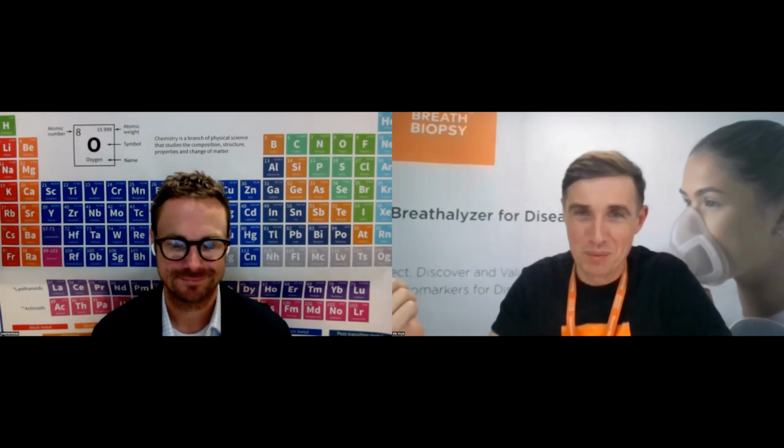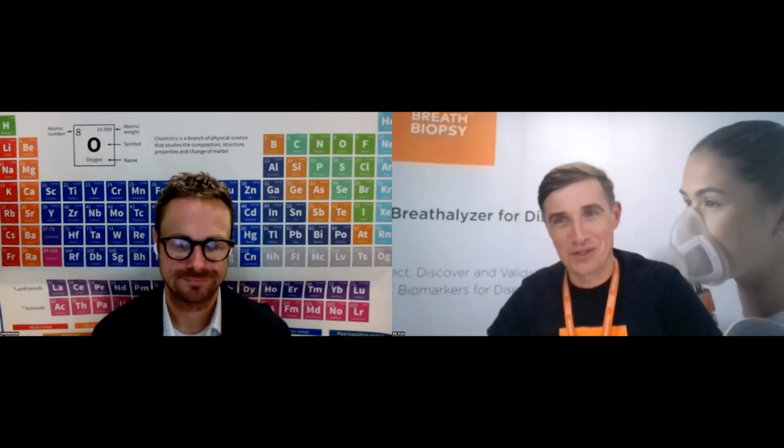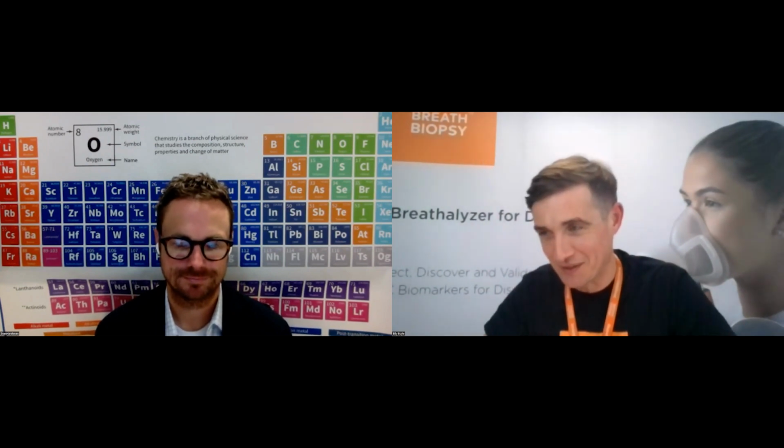Yeah, because I love the example of isoprene. I use the example of acetone as well. So you've obviously got acetone in the background. It's one of the most abundant compounds on breath. So knowing that, if you saw a compound like that come out and you were to try and class it as endogenous or exogenous, you can make the argument both ways. Now, it's easy in acetone because there's an endogenous component, but it becomes a lot more difficult for novel compounds when you can't have a defined origin there.